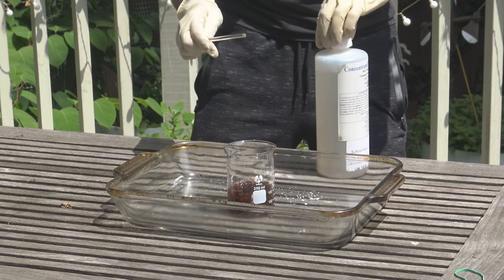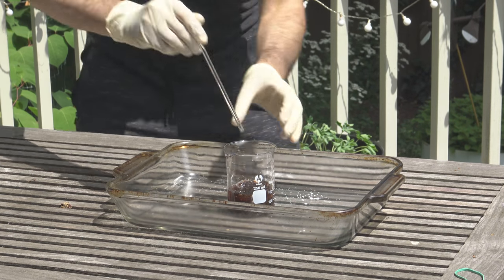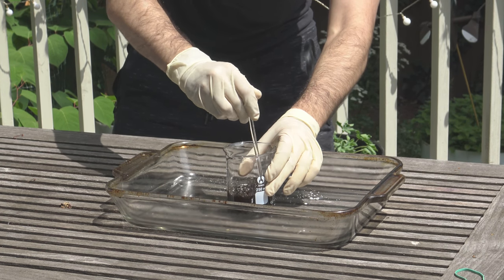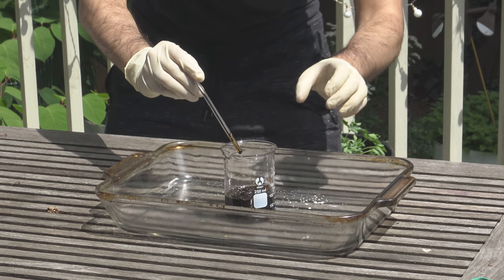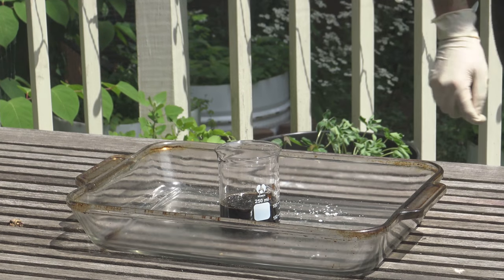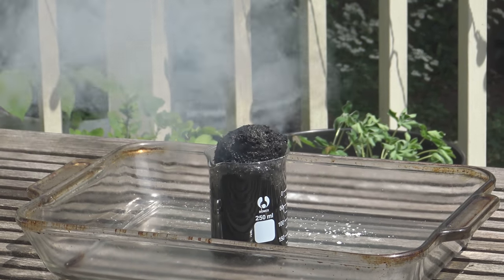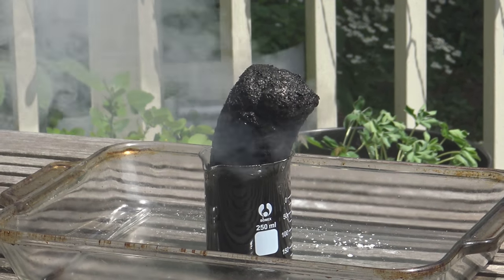Tap that off. You'll see it starting to turn black already on the surfaces. I'm going to give this a little head start. It might take a minute, but the reaction is going to kick off. It's starting to puff up slightly. And there you go — that right there is a carbon snake.